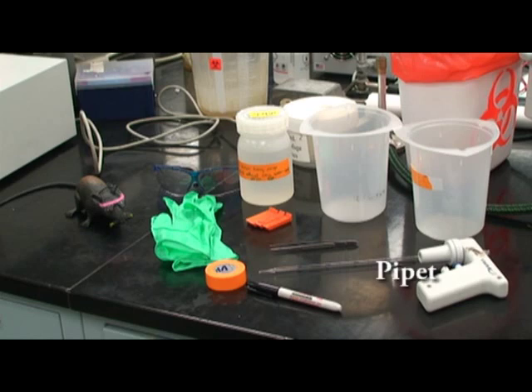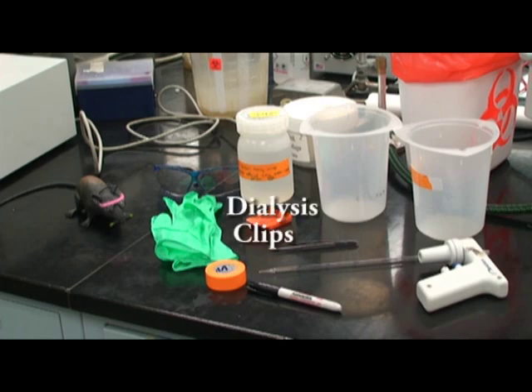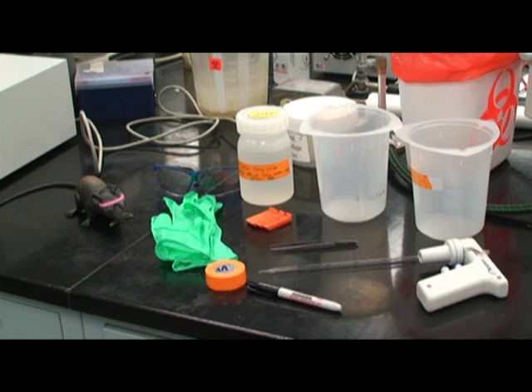A pipette, forceps, dialysis clips, tape, and a marker.